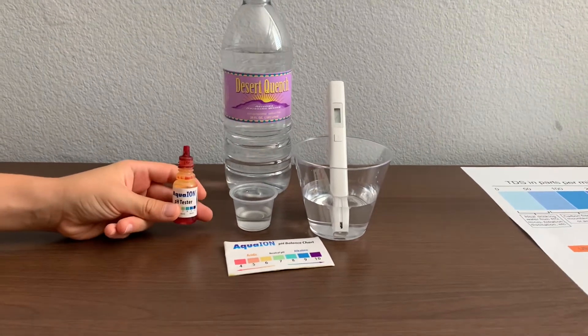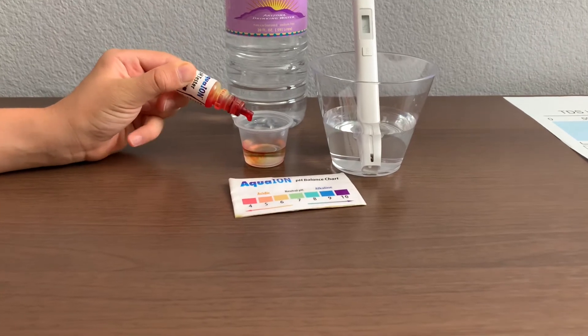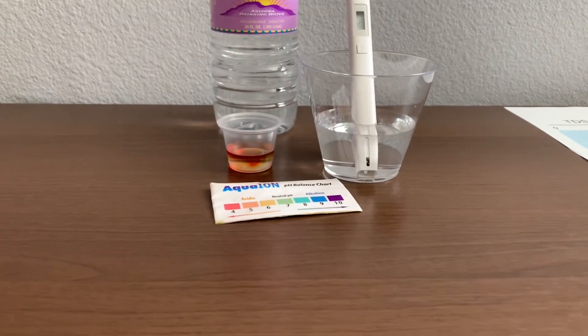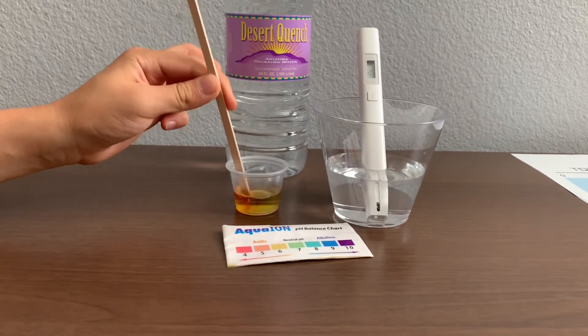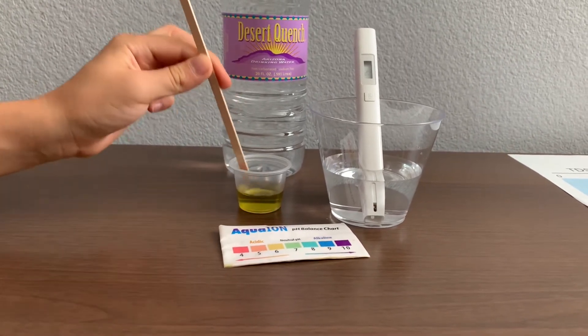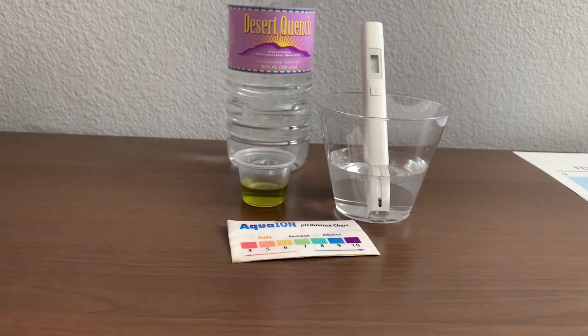Now let's test the pH level. Only do two drops. Let's stir it a little for a better result. I give this a seven — this is neutral pH.